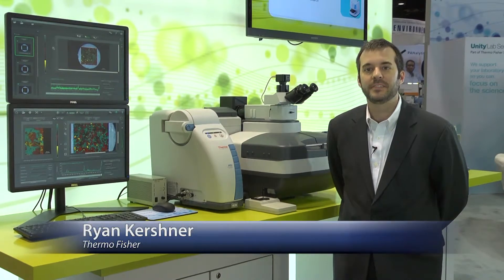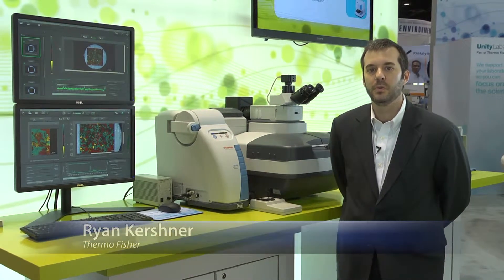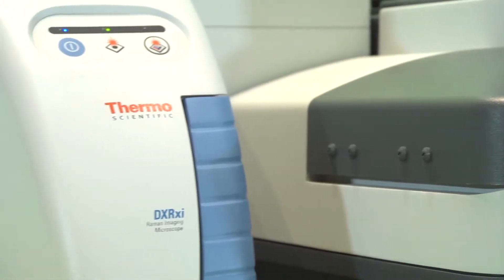Hi, I'm Ryan Kirshner with Thermo Fisher Scientific, and I'm here to talk about the new Thermo Scientific DXR-XI Raman Imaging Microscope.